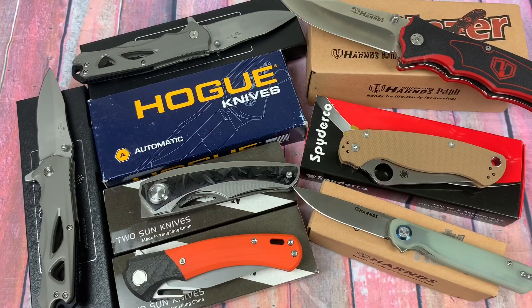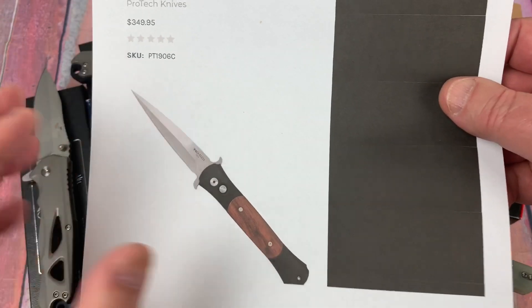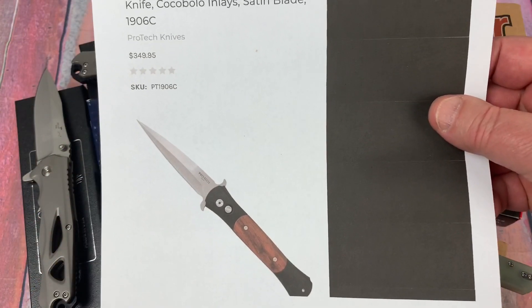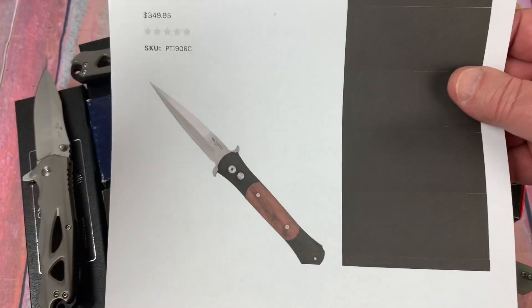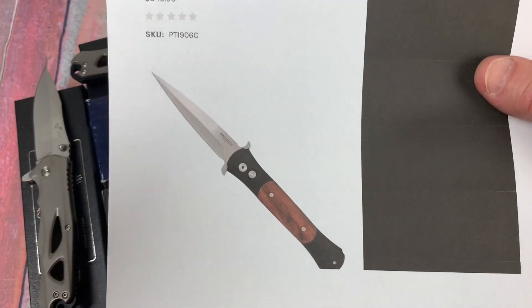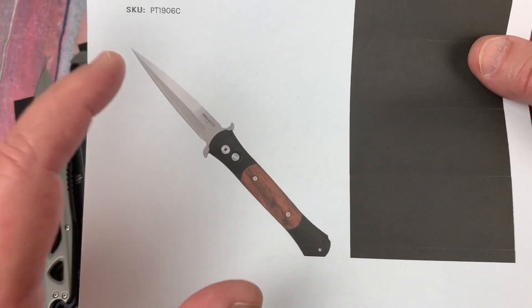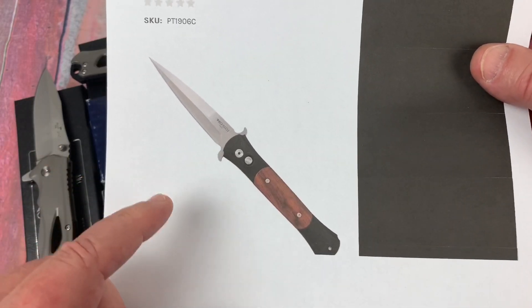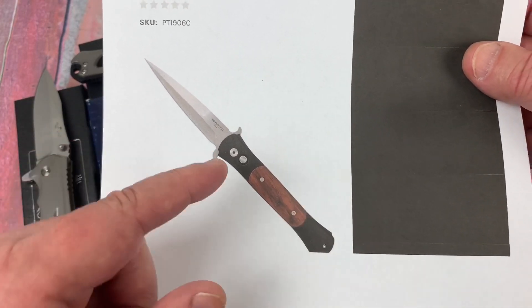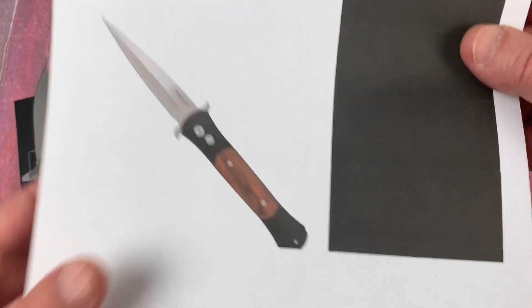The next one is not here either. I had a large Don from ProTech, and that is 154CM — not CPM 154, this is 154CM. This looks just like the knife I sent in for testing, and yes, it is 154CM. The Rockwell number is a 59.